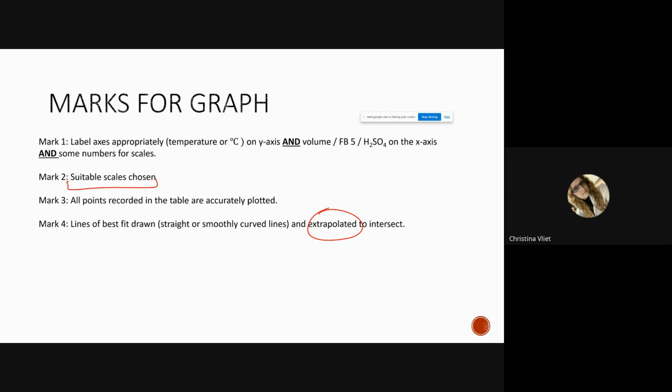All right, make sure to put gloves on before getting started. Yes, strong acids, strong bases. And the next thing, read your instructions carefully. Anything happening to me is a real possibility. Good. That's for the big one. Sulfuric acid.